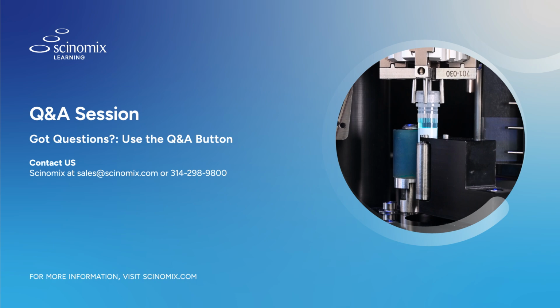Good. Okay. I have a question now from Taylor, who says, how are you measuring the accuracy of the dispense operations? Yeah, so you can add that onboard analytical balance. It'll do a density conversion using the liquid's density and then give you the actual fill volume with gravimetrics. If you'd like to add that, that is a selectable option.